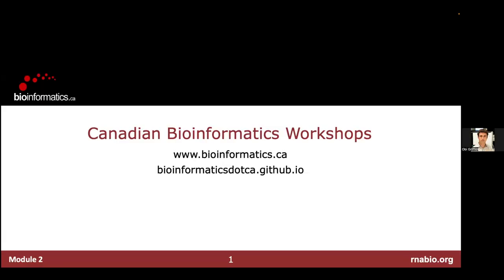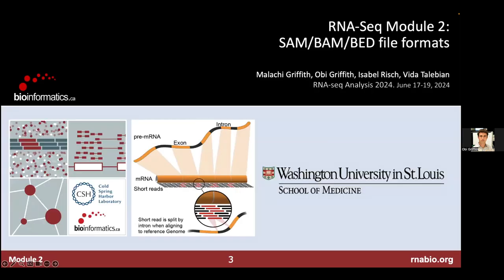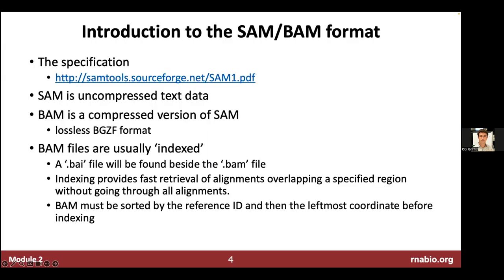Okay, so we're going to do hopefully a not too long lecture just on some concepts around SAM/BAM files and some other kind of gotchas related to alignment files and formats. So this will be, yeah, SAM/BAM and very briefly BED. So you guys have already started playing around with your SAM/BAM files a little bit.